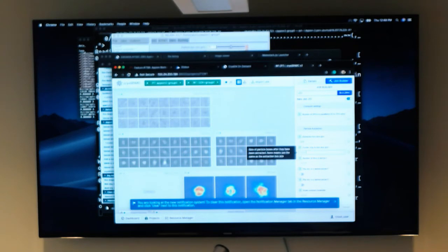Let's say you have too large of a box, there's only so much you can do. You can add a mask, but if it's exorbitantly large, like tenfold too large, then you definitely want to re-extract. So what would a mask do in that case? There are different masks: you can have a tight mask or a circular mask. A circular mask would be, let's say in Relion, the default was 200 angstroms. You have your box size, but it applies a circular mask with a particular diameter, so it's not considering anything outside that, from the center out beyond that mask.